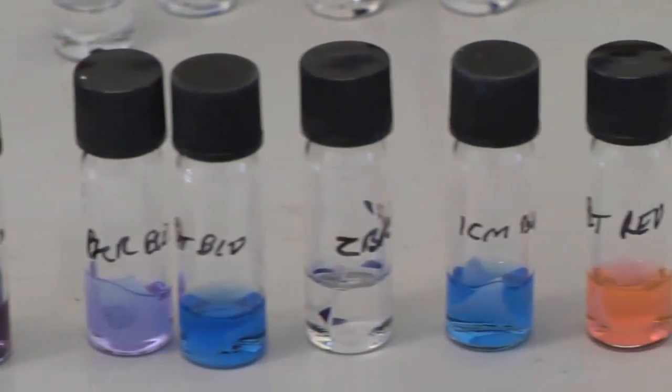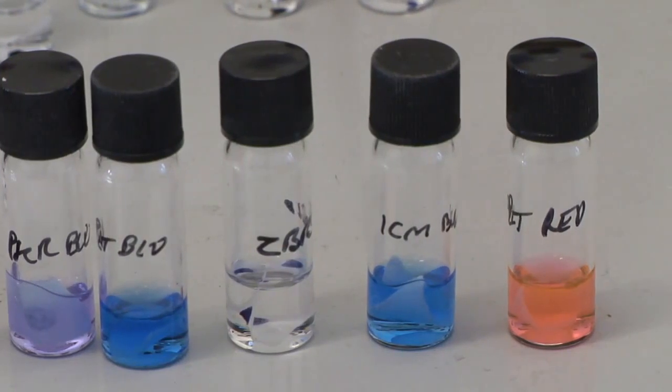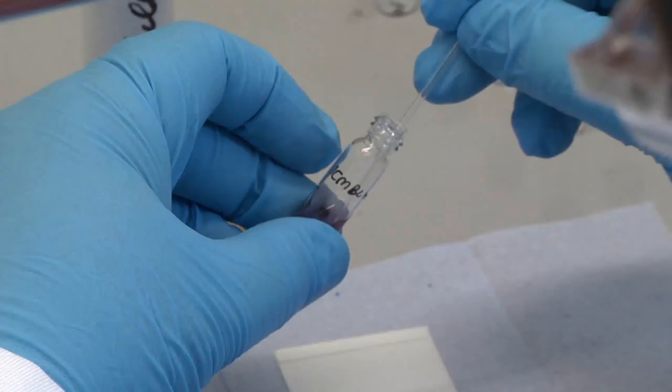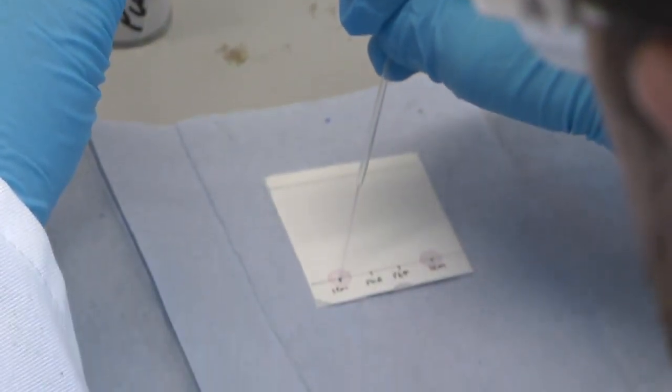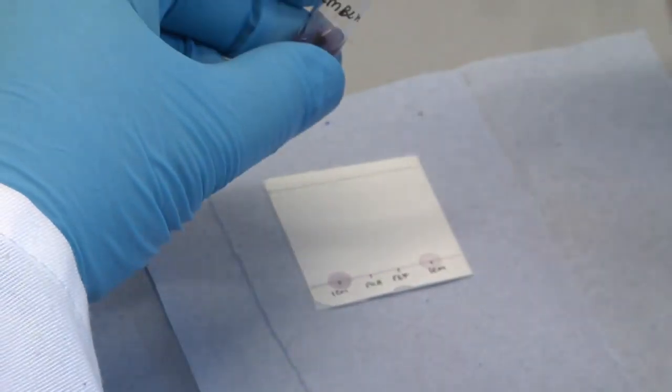These dyes are powders that dissolve in solvents and are therefore called soluble dyes. Because of their solubility, these inks can be tested using a technique called chromatography, where a sample of ink can be separated into its different dye components.